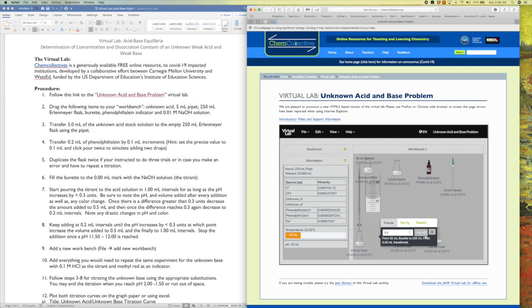So we're at 10.16, 10.26. So that was like a 0.1. I'll do it by 0.2 again. Right, so now it's below, it's like 0.08, right?